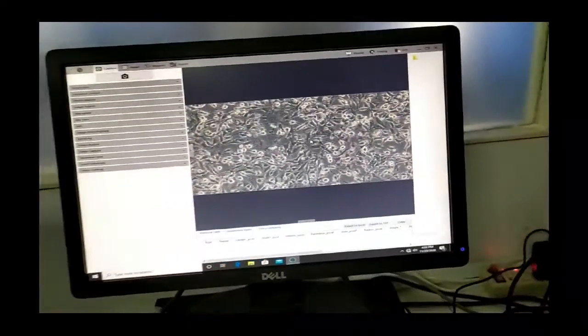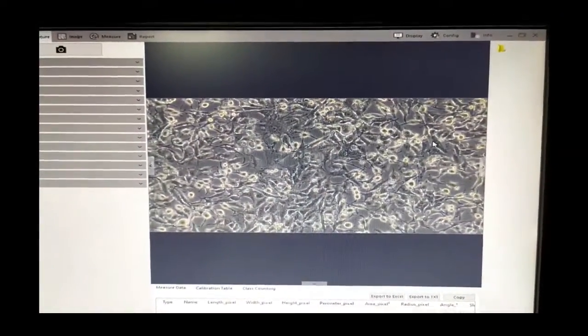What you see here are small spikes, which are nothing but our cells — the A549 lung cancer cell line. This is the magnification at 4x power, so we will increase the magnification. Now it is 10x. When you change the magnification power, you have to do some fine adjustment for clarity. What you see here are spikes and some spindle-shaped bodies. These are the cells which have adhered to the surface of the T-flask. They are fully grown cells, arranging themselves side by side so their shapes are changing.